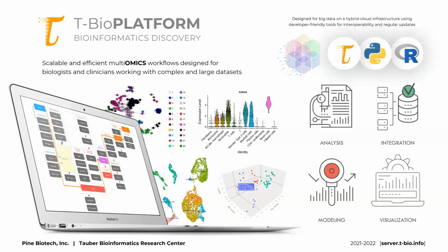One of the major challenges in RNA-seq analysis is related to accurate, reproducible, and effective processing of large-scale datasets that represent gigabytes or even terabytes of data. Such large quantities prevent many from gaining a practical hands-on feel for RNA-seq.